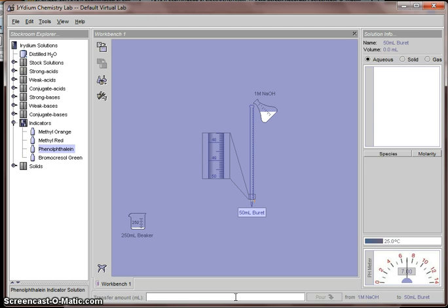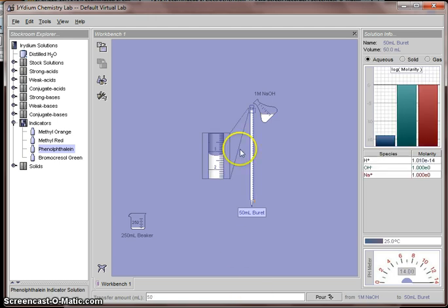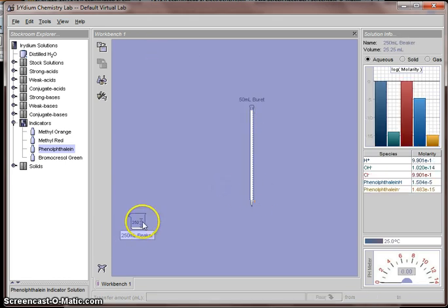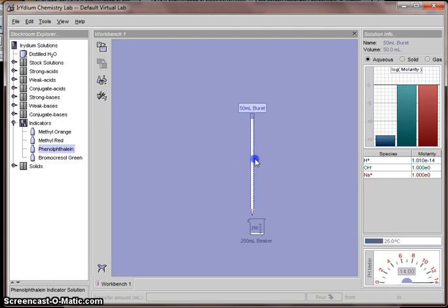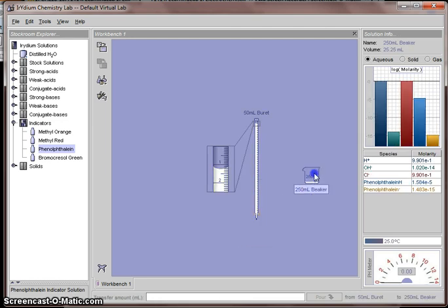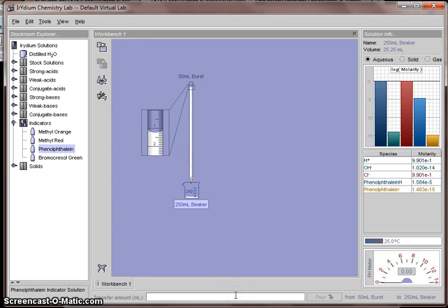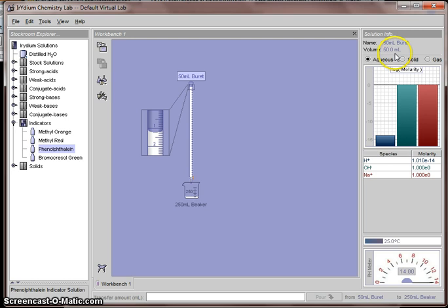we take NaOH, we add 50 milliliter because it's a 50 ml burette. We have 50 ml of NaOH and take that aside. Alright, now all we need to do is to do titration. So we add this in there. Okay, and so you can see the volume of NaOH. You can check the ionic product of water, yeah, and check the pH. It's 14. So everything is consistent with our setup.